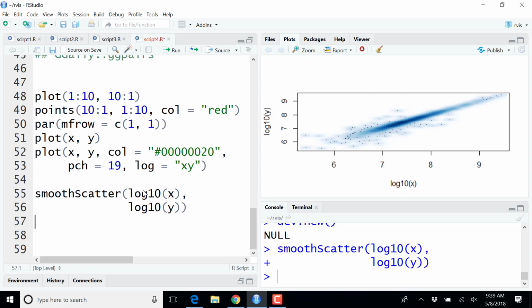Yes? Taking a step back, this is all base R. We've not done anything in ggplot. This is sort of where we start with a blank canvas. Yes. By the way, ggplot has some geoms to do that kind of plotting, but if we want to do anything in ggplot2, we couldn't pass x and y vectors. We would need a data frame to plot this.